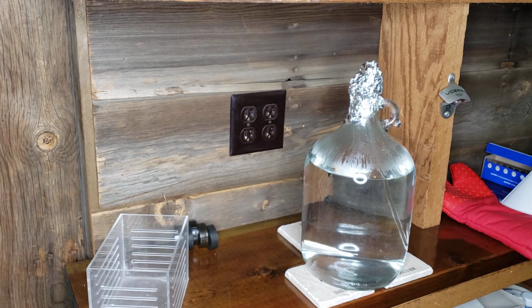I use this method for the clean cultures, and then for cultures that I'm not necessarily going to be using to start new cultures from, the cultures that just get fed to the copepods, a lot of times I'll just skip the whole heat sterilizing process, because this does take almost an hour per culture, so it's a lot of time. So the cultures that don't need to be sterile, I'll just use filtered salt water and not heat sterilize it. But yeah, that's it. That's all I do for phytoplankton cultures.